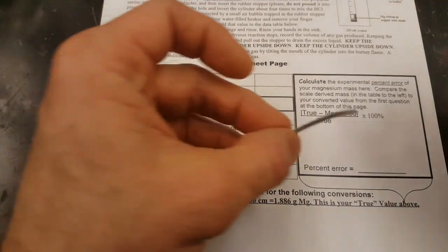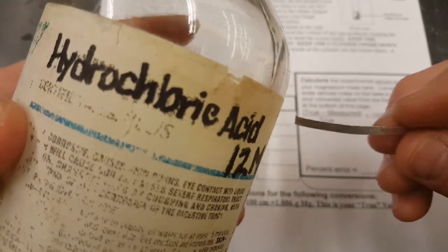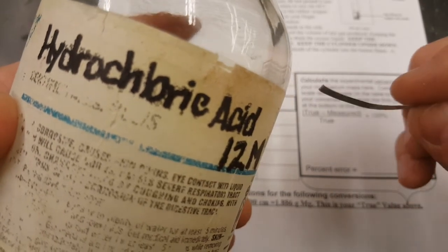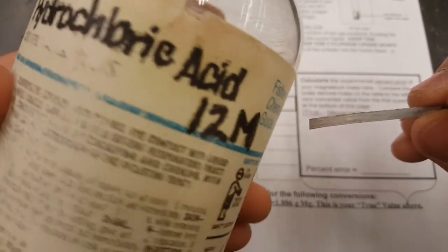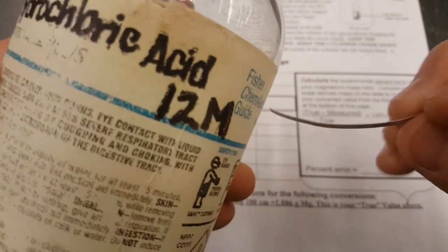Welcome to the magnesium and hydrochloric acid mole ratio lab. You guys have been studying moles a lot lately, and we're going to try to prove that you should make a certain amount of hydrogen gas by mixing hydrochloric acid, concentrated hydrochloric acid, and pure magnesium.